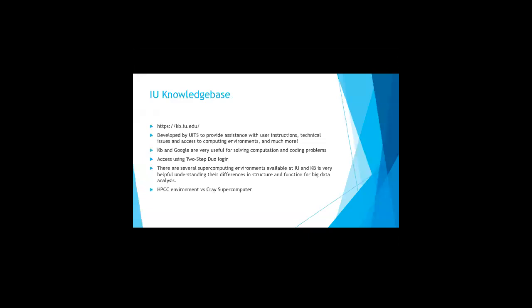As we move into DNA sequencing, which is some of the lectures that we're going to go to, another thing that will help you a lot is provided by the Broad Institute at Harvard. It's called the GATK Best Practices Guide. GATK stands for Genome Analysis Toolkit. It will give you hints and some of the best practices to get the highest quality data that you're trying to get. So you have Google, you have the knowledge base here from IU, and you also have the Best Practices Guide. However you set up your system, when you try to access the knowledge base, it'll give you the dual authentication: you may get your sign-in and then a phone call or a text. That's how you'll get into it.